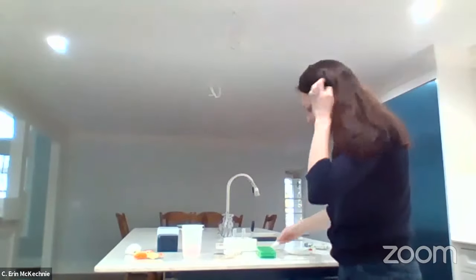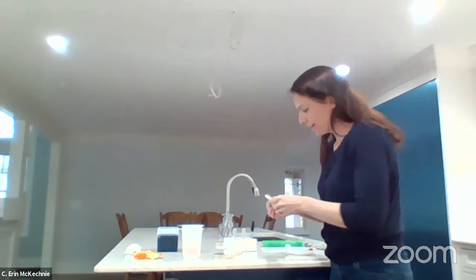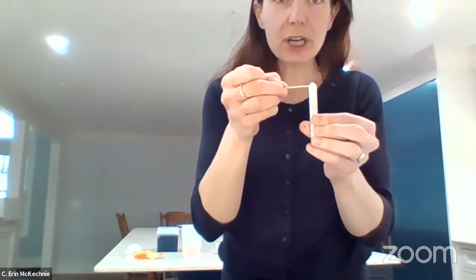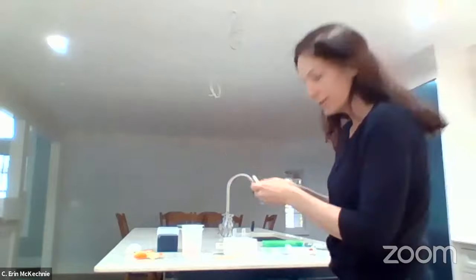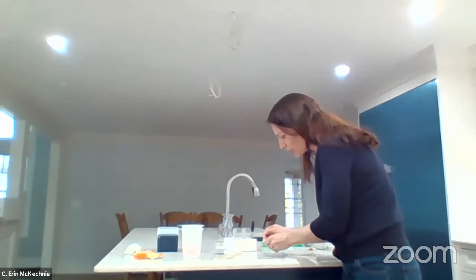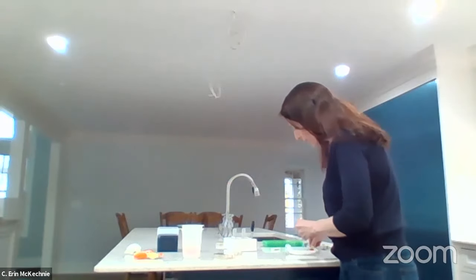I'm going to take these out now and put them onto the dishes. I use a very simple method to do this. I use a little toothpick, okay? I'm just going to push out those little pieces of paper and let them fall onto my countertop right now. So this one's the ampicillin. I'm just going to let it fall out, and I'll pick it up and show you in a second because I know you're kind of far away from me. This toothpick is not so good. Okay, so I just push out another one. Okay, perfect. Throw that out.